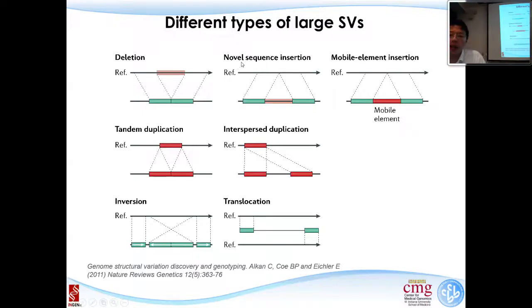The second mode will be novel sequence insertion. You can see this is the reference genome, but in this part there is an insertion. And this insertion is actually pretty novel. We don't know where it comes from.